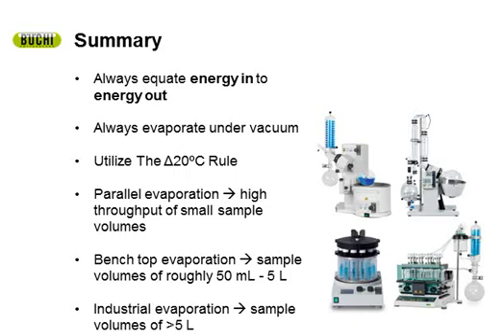I don't know how much of a difference in throughput it's going to make, but it would help on certain solvents. Let's say ether, DCM. Those are low boiling point solvents you want to use with dry ice, because you have to worry about how volatile they are, and the fact that they can re-evaporate from the receiving flask. So it's not so much the throughput. It's more the chances of the re-evaporation occurring from the receiving flask, and keeping those vapors that are popping up back in the condenser in liquid form and dropping them back down into the receiving flask.